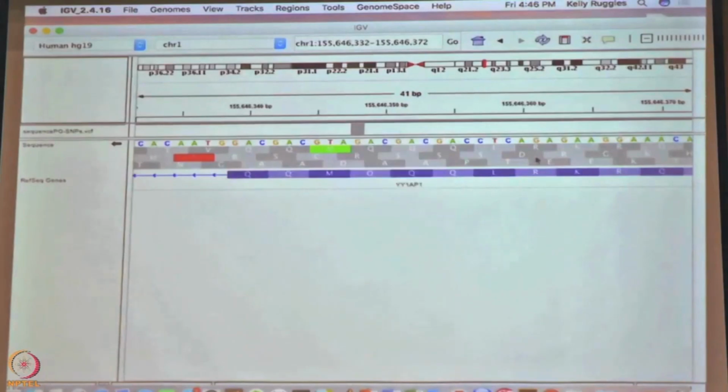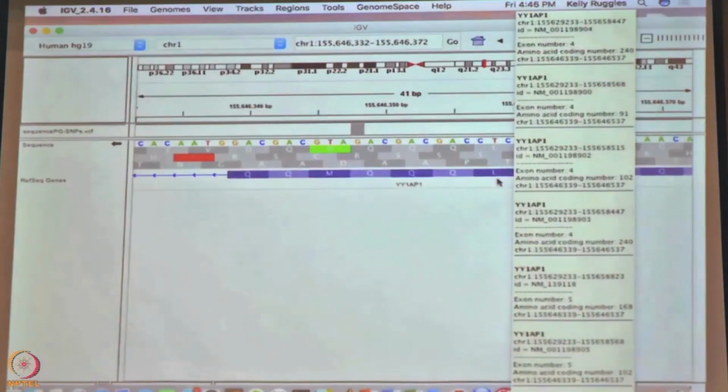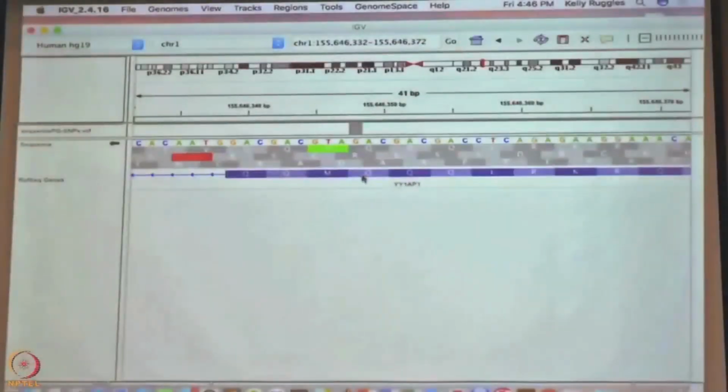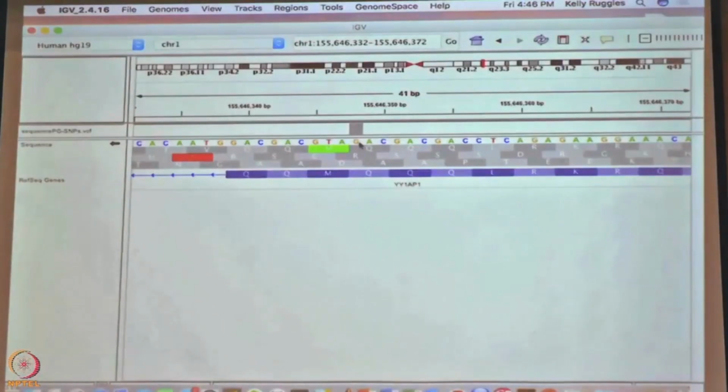So if we wanted to put this SNP into our database, we would be moving from right to left, and we would be creating a peptide sequence. We know that trypsin is going to cut at R, so I guess we could start here, and we can go L, Q, Q, and then at this Q, instead of a CAG, we're going to have a CAC.